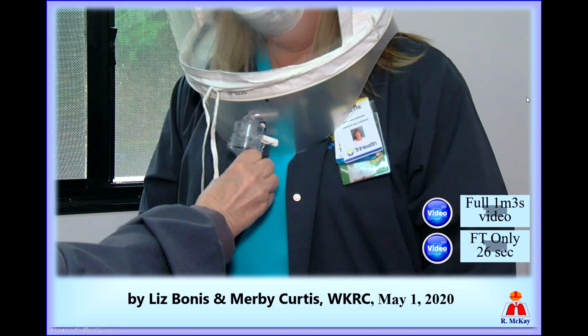So it's really amazing the number of times I've seen people spray the aerosol into the wrong opening.